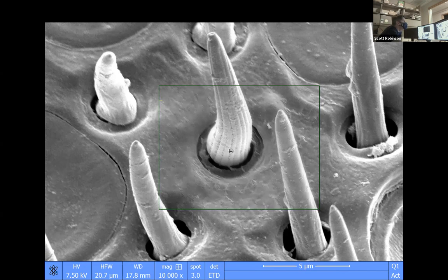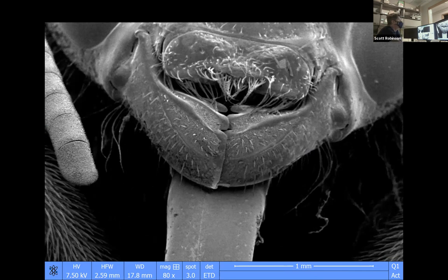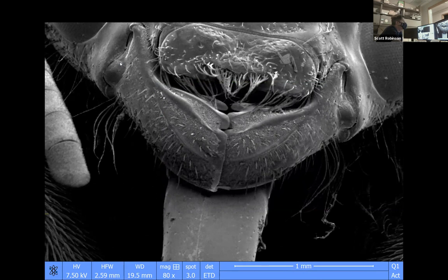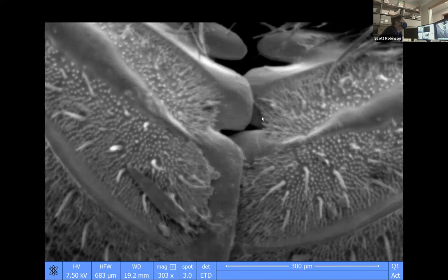You can see that this seta that's sticking up out of here has some fluting on it, and some of the other ones don't have any fluting. It's kind of a cool thing that you have so many different things to study. We can also look at the mouth, and Josh had described the jaws earlier. The jaws open like a gate, kind of. You can see on either side these hinges, and those hinges open like a gate, and you can see the little structures on there that would allow it to grip.